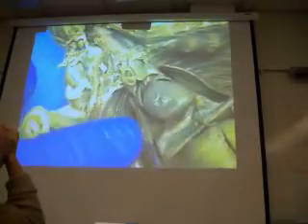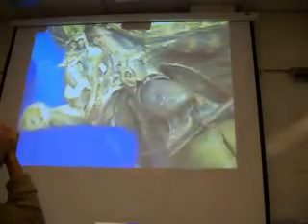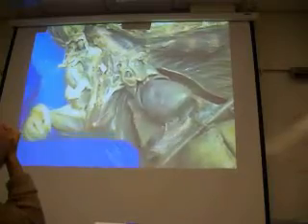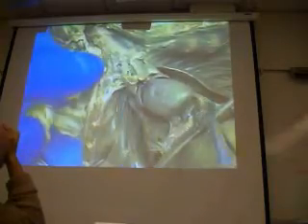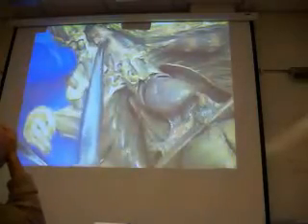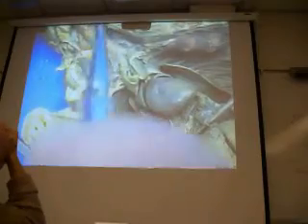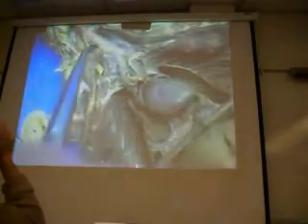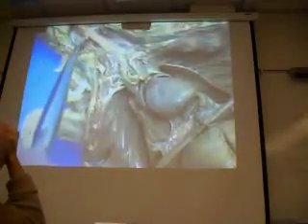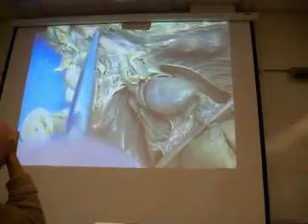Right. So on each side of the heart, here are the lungs. Right, so you can see the different lung lobes over here. Right. And what takes the air in and out of the lungs is, here's the trachea. And then when you come up here, you can potentially find some of the various glands, the thyroid glands and the parathyroid glands.